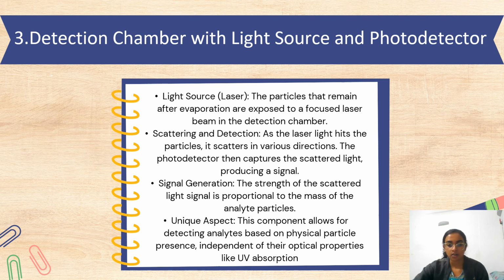ELSD's design allows it to detect a wide range of compounds without the need for chromophores or other optical characteristics. This makes it a universal detector for non-volatile compounds in liquid chromatography.